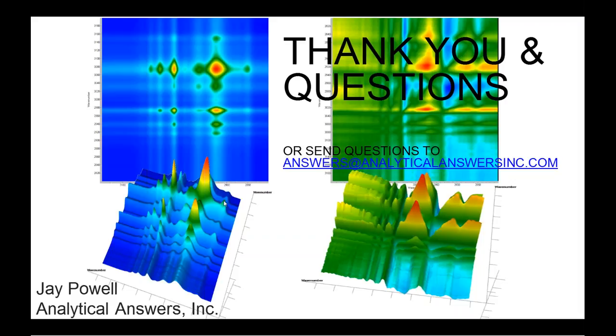I see you've added the additional information, a Kevlar glued to a PEEK, polyether ether ketone, quite possibly. Is this using an epoxy or a UV cured adhesive? If we can get access to the adhesive itself, either by infrared micro ATR sampling or reflectance. I see you've said it's a two-part epoxy. Again, we can do infrared, either ATR sampling or reflectance sampling, to see if the epoxy shows an infrared absorption pattern that is consistent with a properly mixed and cured epoxy. As you said, non-destructive, I'm assuming you do not want us to use a transmission sampling.